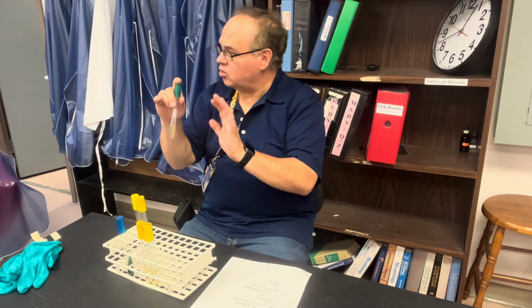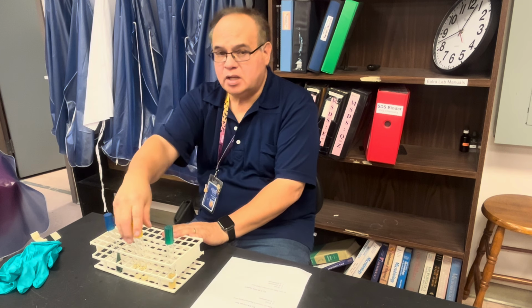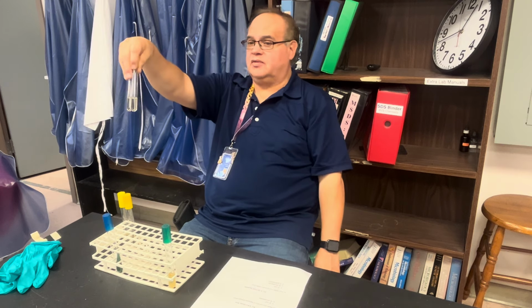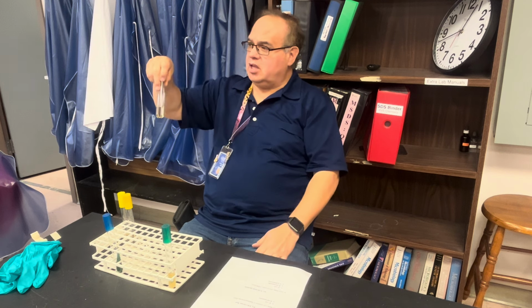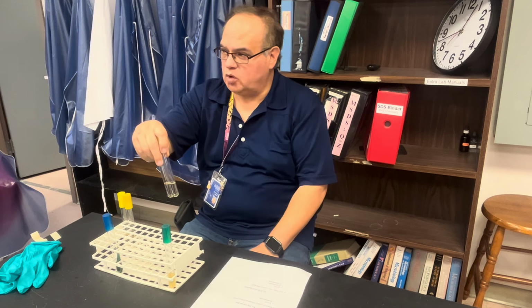Okay, you're only going to add the organism today. You're not going to add any of the reagents. The next two tests are exactly the same. They're two tubes that are exactly the same, but we're going to treat them differently. We're going to label one MR and one VP. The MR VP are always run in tandem. They're always run together. Okay?